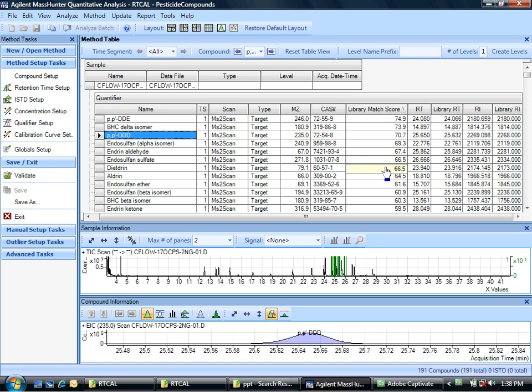So that demonstrates the use of retention indices, and I think with just a bit of extension, you can envision going through with unknowns analysis in the flavors and fragrances industry and using this technology to look for things that you have in your own custom library, using retention indices as a constraint as well as spectral matching.